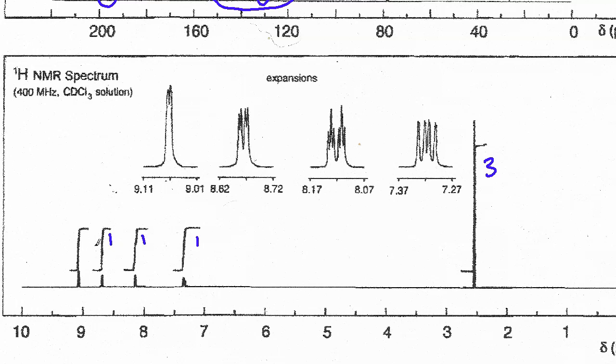Now, if you were wondering how you come up with that, I'm eyeballing this, but because I already know there's a methyl, this has got to be the methyl based on the ppm, around 2.5. That's the only place it could show up. These are all aromatic protons, and on top of that, the relative ratio: if I know that this is a methyl, I look at the height of the integration, and then I look at the height of these. These are about 1/3 the height of this methyl one. So when I compare them, I could safely say if it's 1/3 the height, then it's a 1:3 ratio. So 3 protons associated with my CH3 group, which that definitely is, and then a bunch of 1s down here. All right, and you can see the expansions of them up in these areas.